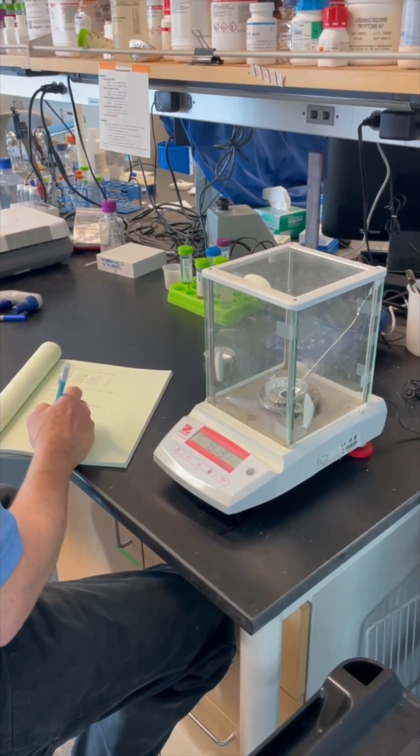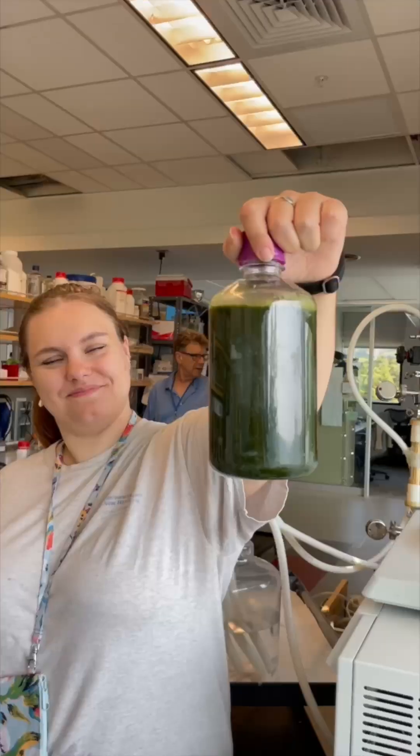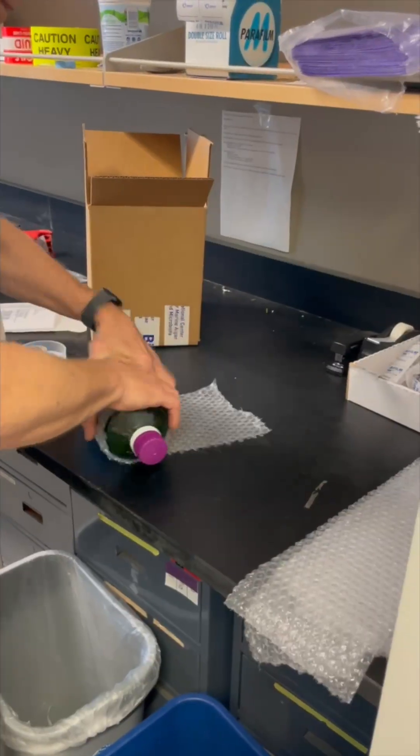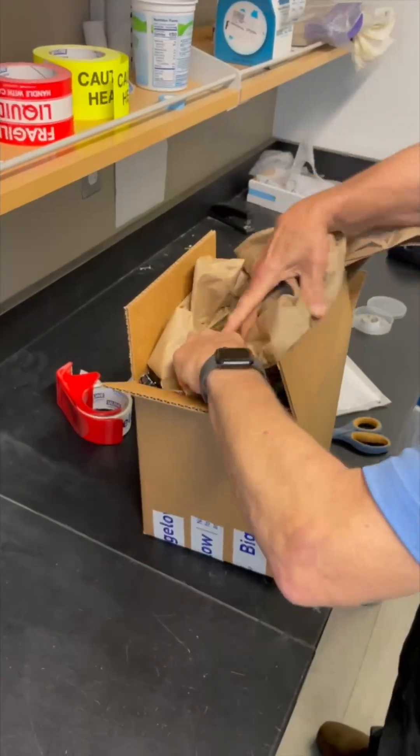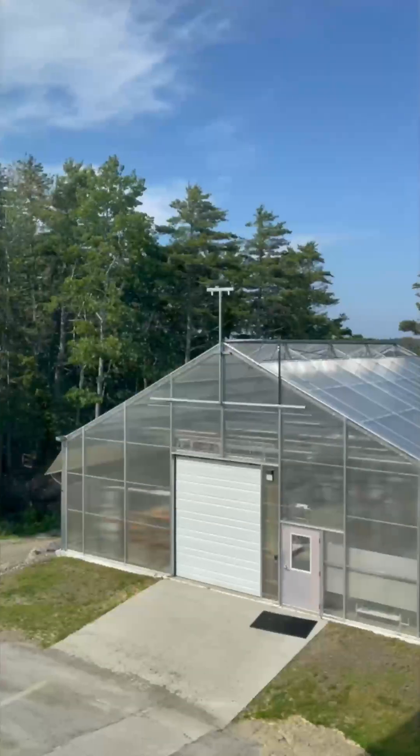Up in the lab, we measure the dry weight of the algae and make calculations to dilute the harvested algae to the right concentrations for the Algae Foundation kits. Then we prepare the bottles for shipping with a little padding and a cool pack. We secure the bottles, tape up the box, and this algae is ready to ship across the nation from right here in Maine.